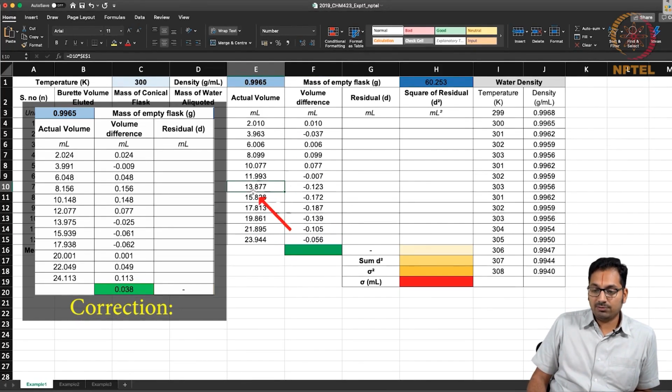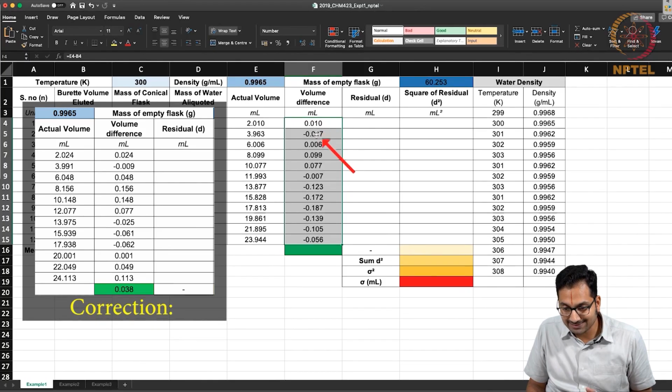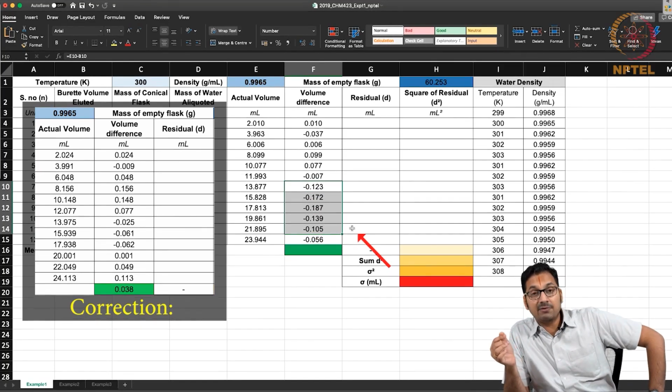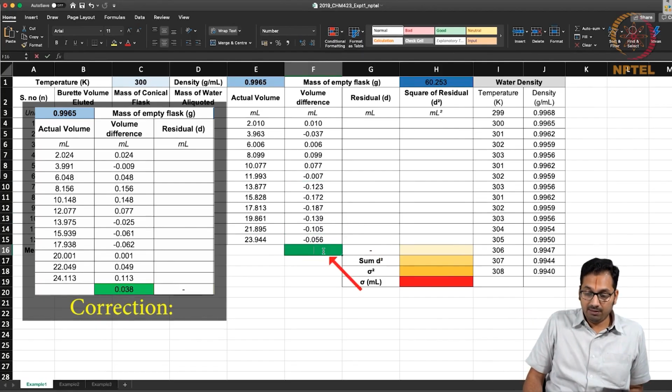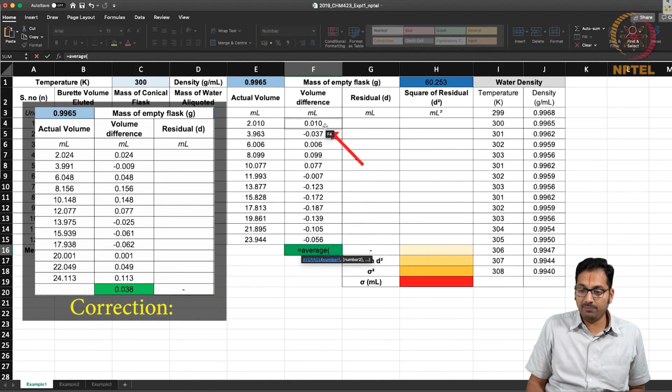So, now what you see is that for 12 different measurements, you have been fairly accurate, where the mistakes happen in most cases in the second decimal. If you carefully pay attention, for these measurements, the mistake happens in the first decimal itself. This helps you understand that there are measurements where one ends up adding a little more or a little less. One way of determining where you fall is to take the average of these differences by using the average formula.